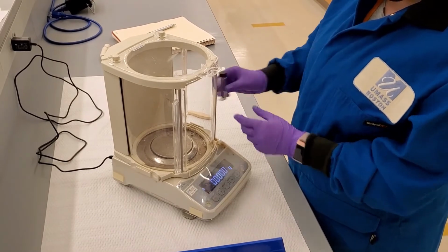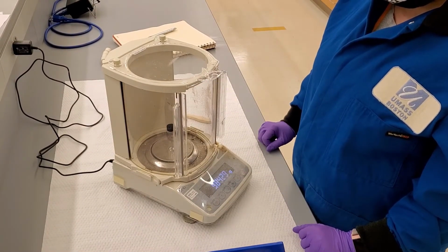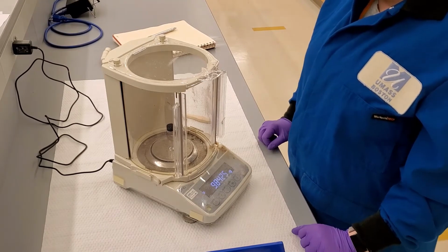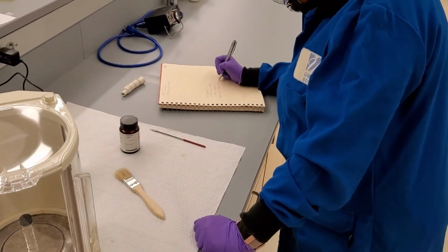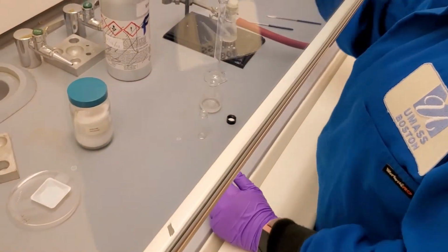Before we isolate our product, we need to prepare our product vial. Obtain a new product vial and cap, and obtain the weight using the balance. Record the weight in your notebook. Instead of a product vial, you could also pre-weigh a clean and dry beaker.